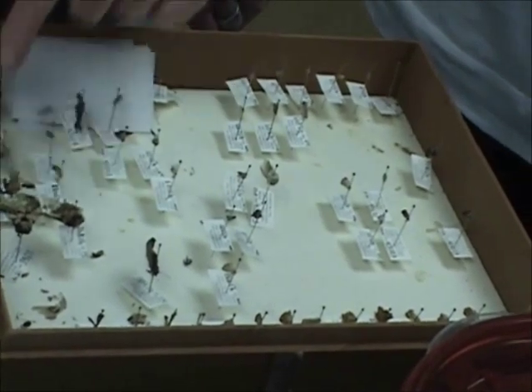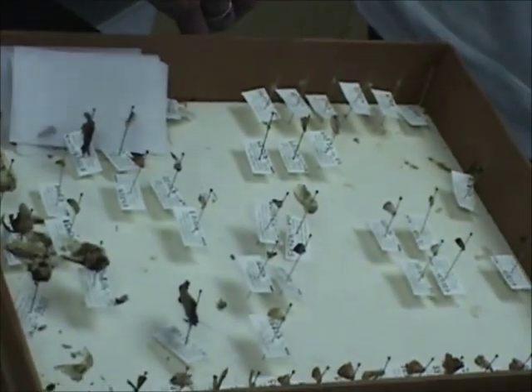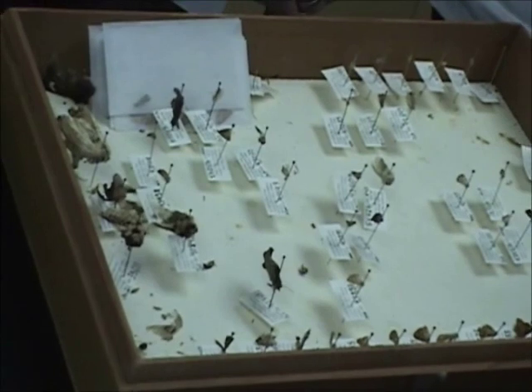They shatter. For some of these three, I had to do abdomens back on, and for others, if I wasn't convinced I knew which abdomen went with which, I wasn't doing it. So what's the purpose of pinning all these down — are you guys doing it?